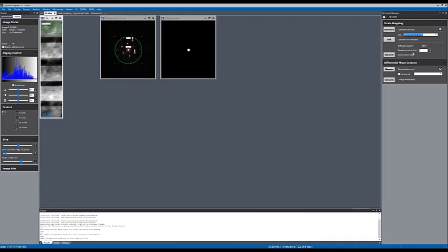The other thing is if you are on the microscope and you want to do a quick analysis and you have collected, let's say with the K3IS, a 512 by 512 scan area, it might take some time to finish calculating the whole strain map.